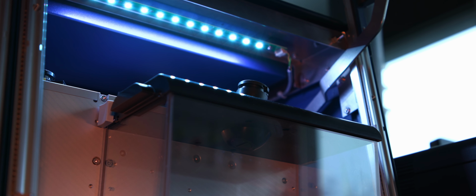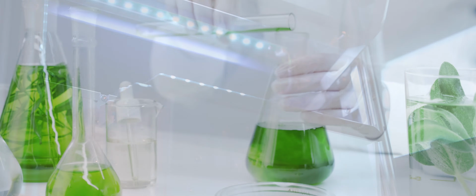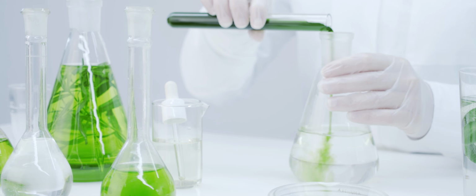High-performance thin layer chromatography, or HPTLC, is used to separate substance mixtures. For example, you can take a plant extract, separate it into the individual components, and then determine the quantity of one component, for example, the active ingredient. It can also determine whether it is a fake, or whether foreign substances have been mixed in.